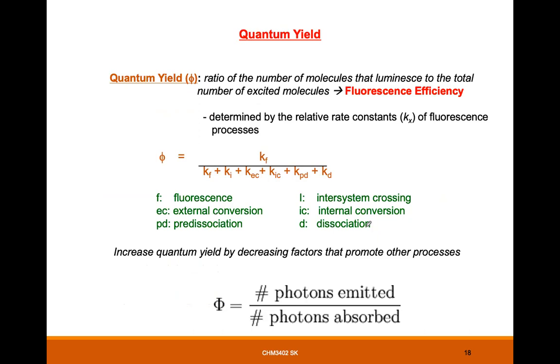So if we are talking about UV or visible region, visible region especially, we're talking about Beer-Lambert's law, right? To quantify, to do some quantitative analysis. But for fluorescence, in order to measure how high is the fluorescence efficiency of the molecules, it is using the term quantum yield. Okay, so this is the formula.